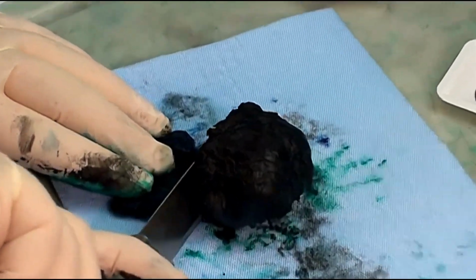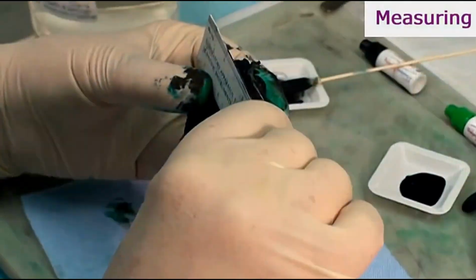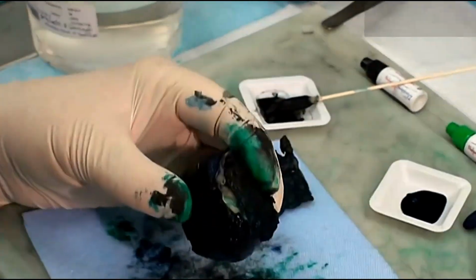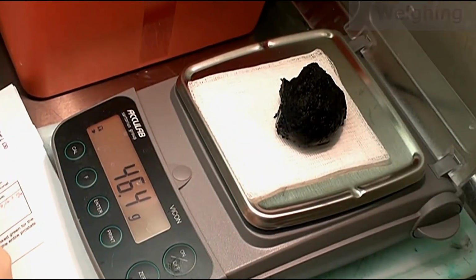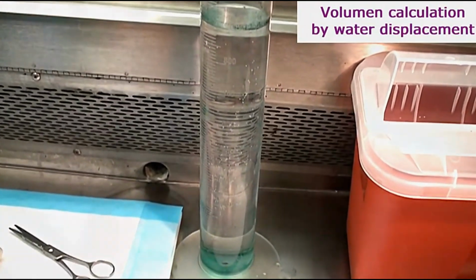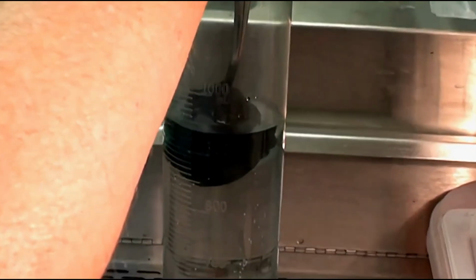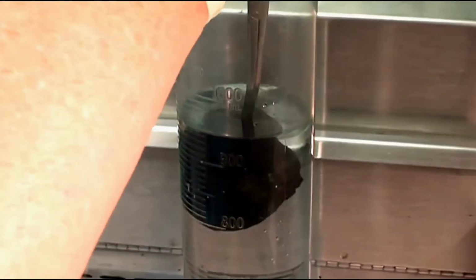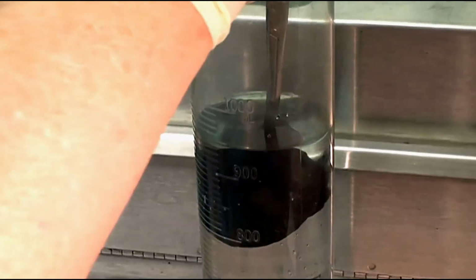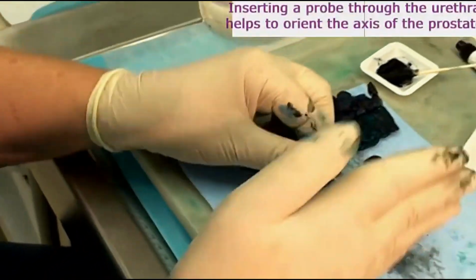And at that moment we remove the seminal vesicles, as you can see there, and then we go to the proper measurement of the prostate itself without the seminal vesicles, both for the weight and for the volume. And for the volume, we calculate by displacement of water in a cylinder with water, and by the amount of cubic centimeters that are displaced, we have a very good measurement of the volume.